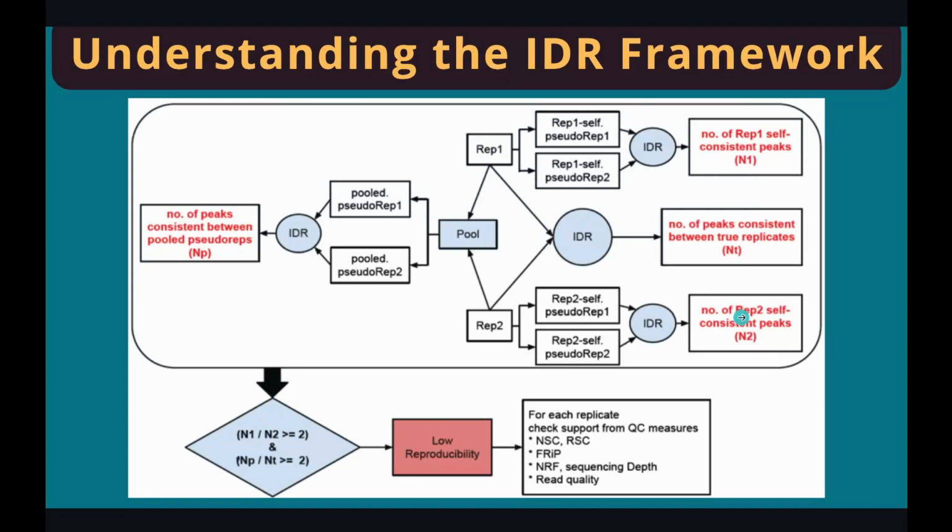If you're still not confident enough and have absolutely nothing else to do, you can split each replicate into 2 pseudo replicates, call the peaks, go through IDR, and get a peak set. Repeat this process many times for each replicate, and then compare the number of peaks from the 2 processes. But seriously, what's wrong with you?